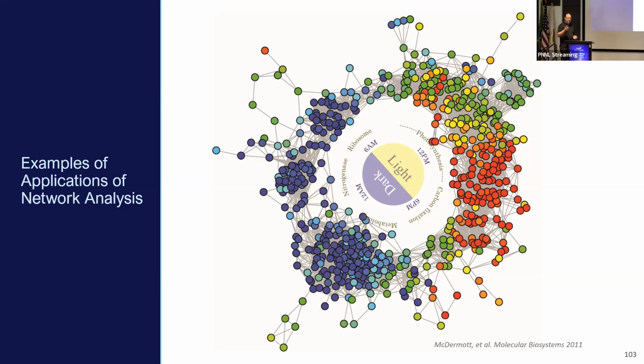I'll explain very briefly what this kind of means. So all of the genes that you see on this side basically have peaks during the light cycle. So they are peaking during the light cycle. They're basically on some kind of sinusoidal rhythm, right? By their light and their circadian rhythm. And all of these are peaking in the dark.